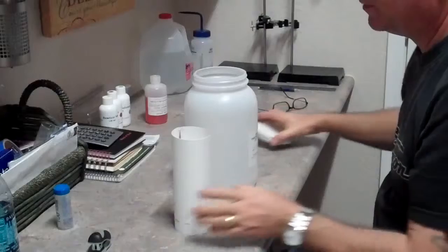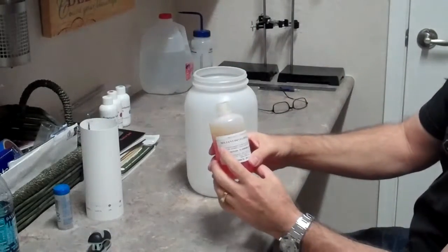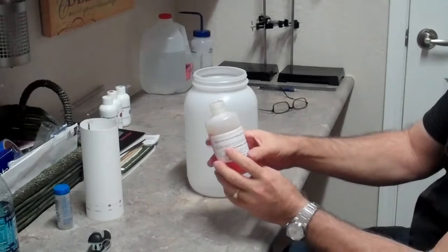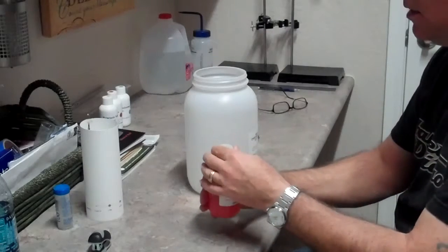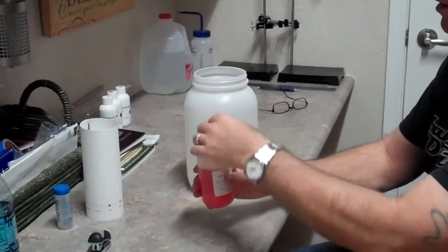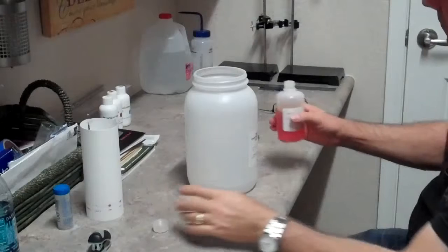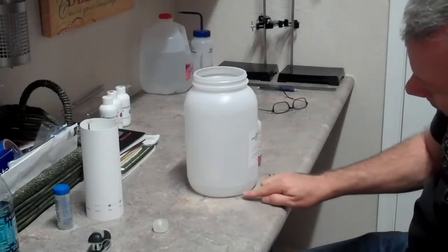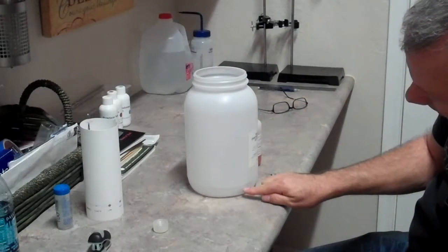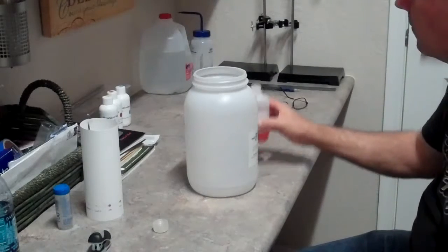We're going to take our one gallon container, take the lid off, and take our solvent developer solution, which does have a pretty strong smell, so you're going to want to do this in a fairly ventilated area. We're going to pour enough of this in here to put about a half inch of solvent in the bottom.